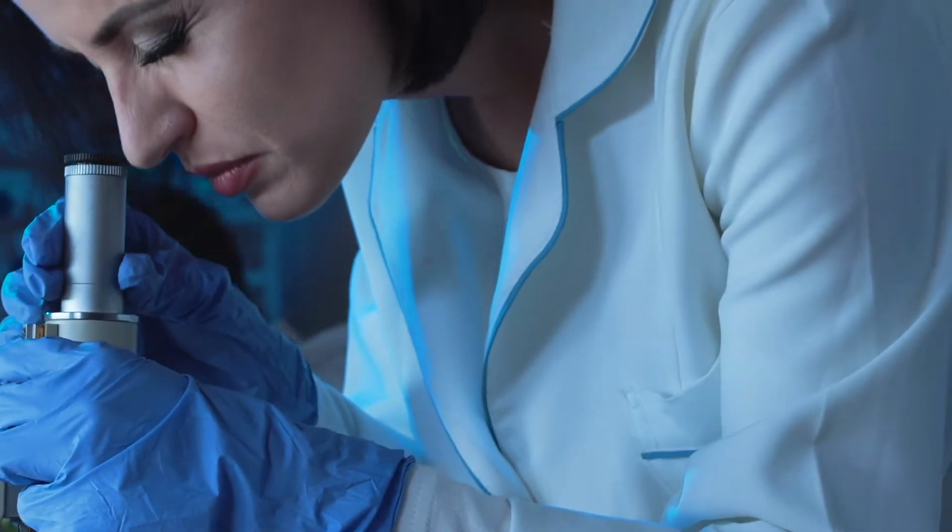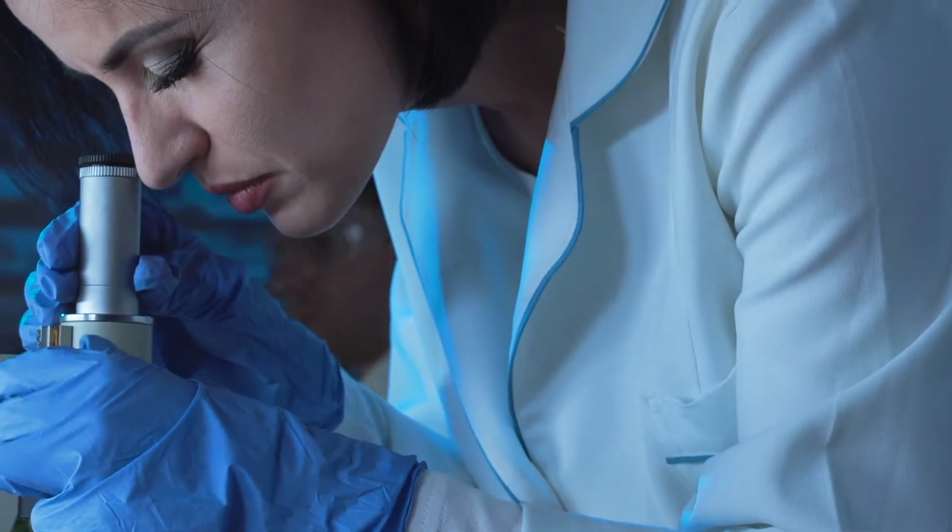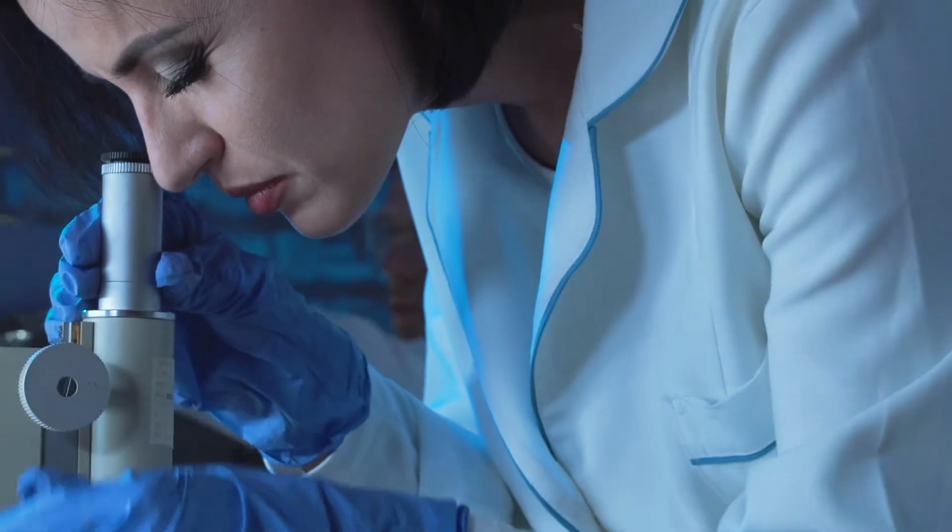Using a microscope, for example, it's not something that you have access to all the time. The students only ever get to use it on occasion. The videos were created so that they can review how to use a microscope before they come into their first laboratory class, which means that class is then spent actually doing the activity that they're supposed to be doing rather than teaching them how to use a microscope again.